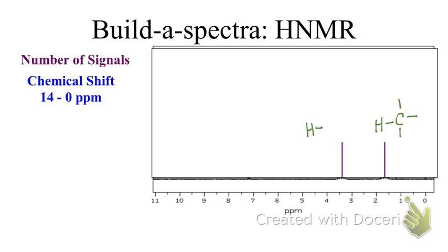Nope, also not up there. Nope, well, yeah, we do have that, but we just looked at that. Do you have, say, an IR? Yes. Yeah, what does the IR tell you? It's all alkanes. It's all alkanes.